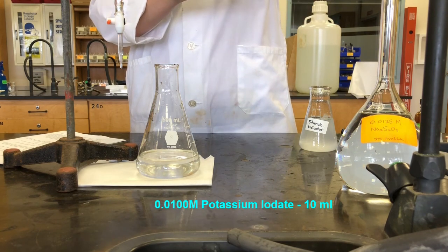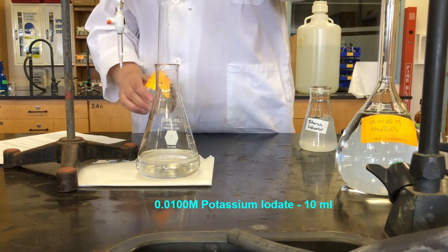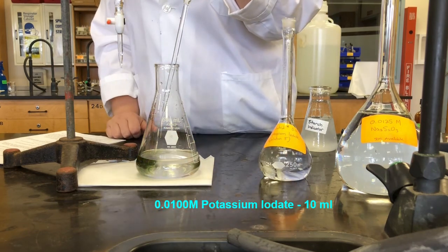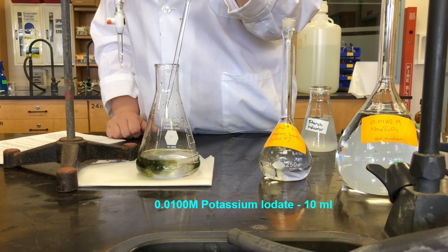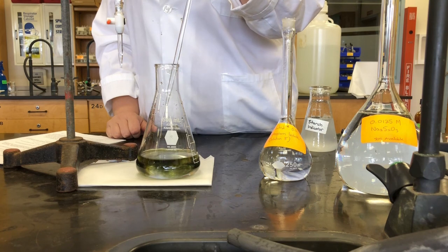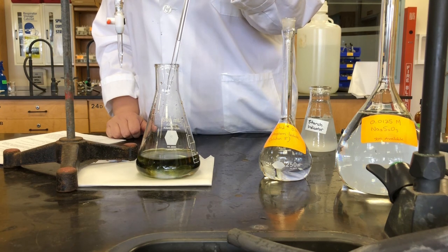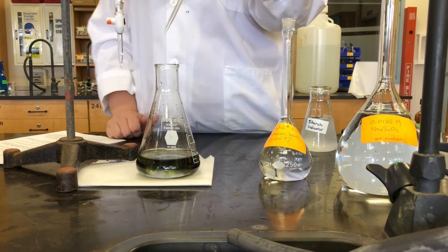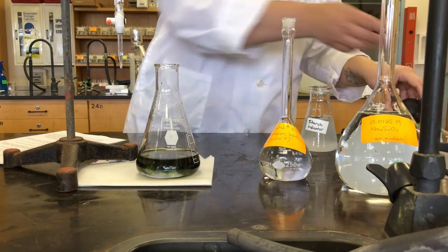Eye level. There we go. Let that pour in. And you'll notice we're getting a greenish color solution with our potassium iodate. Slightly bluish green, that's the color of the starch indicator that we're seeing there. So that's to be expected.